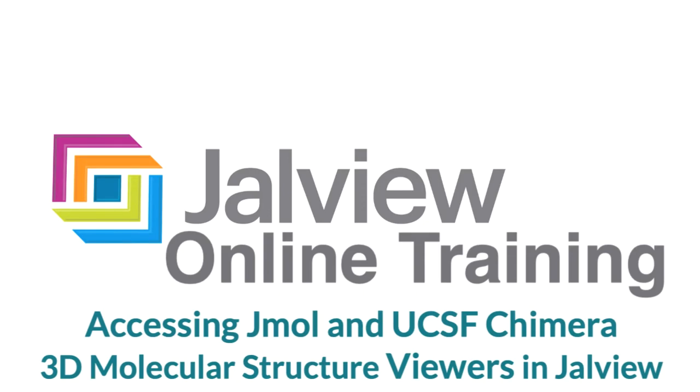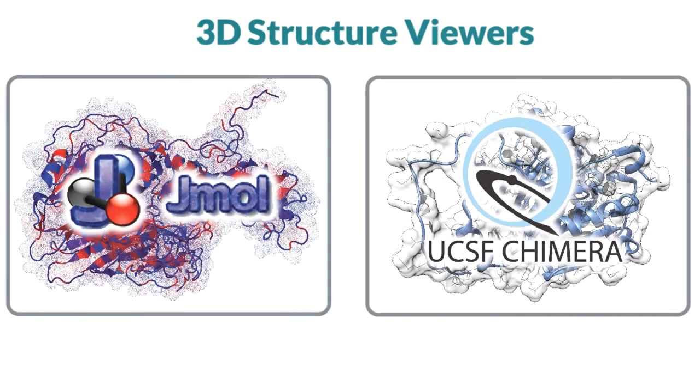In this Jalview online training video, I will consider Jalview's structure visualization capabilities. There are two options for 3D structure visualization in Jalview: Jmol and Chimera.